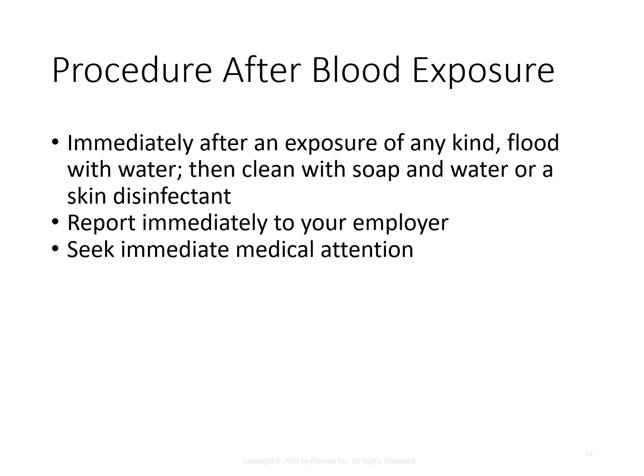Procedure after a blood exposure. This is going to depend on where you are working. It could be a little different, but generally, if you have an accidental needle stick, because accidents happen, we're all humans, what you would do is immediately flood and wash it with water. Then you're going to clean it with soap and water or a skin disinfectant. Generally you are going to run it under running water for usually about 15 minutes.